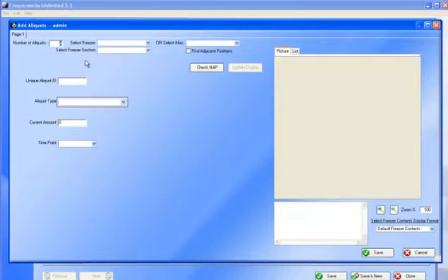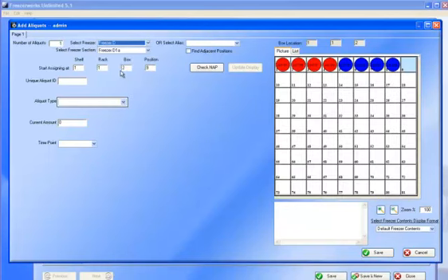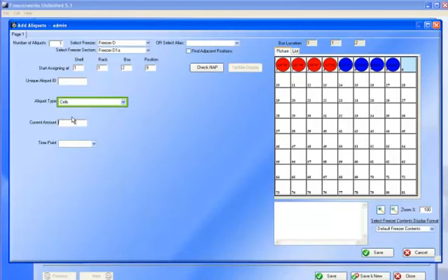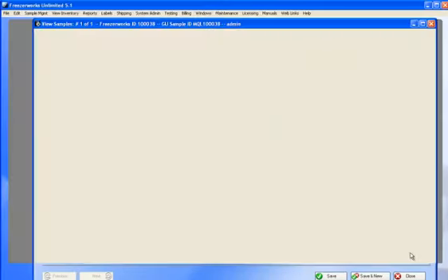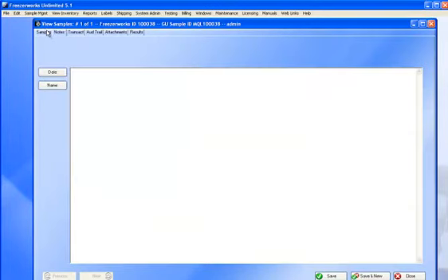And let's say that I've got 1 more sample that I want to put in here, and this might be a DNA sample. Or I don't have DNA. Let's go ahead and call this a cells or a Buffy coat. Let's go ahead and do cells here, and just 1 aliquot of cells. Let's make that current amount of 1. And so we can see here, and let me refresh this screen.